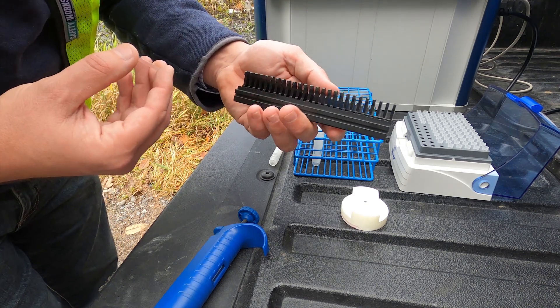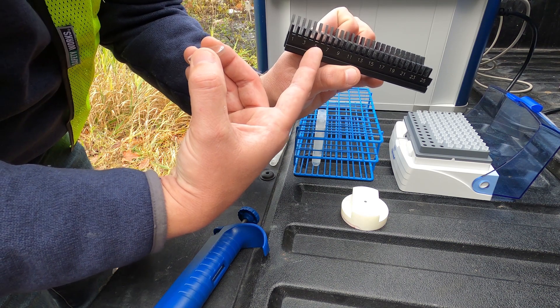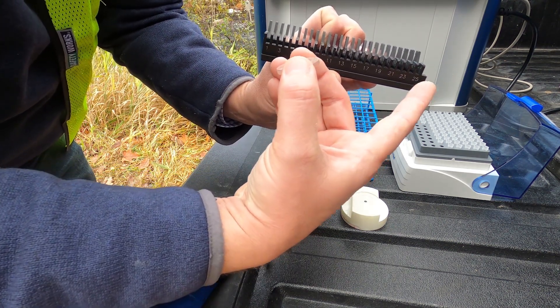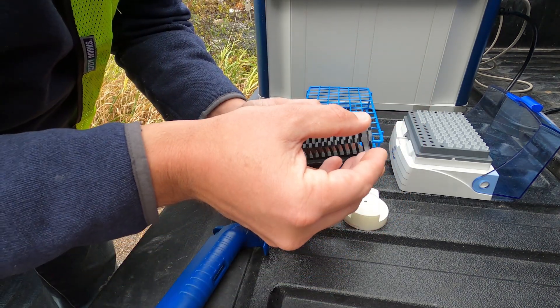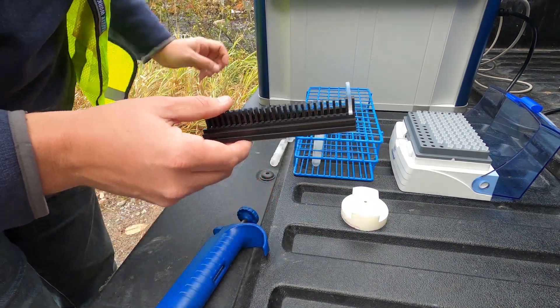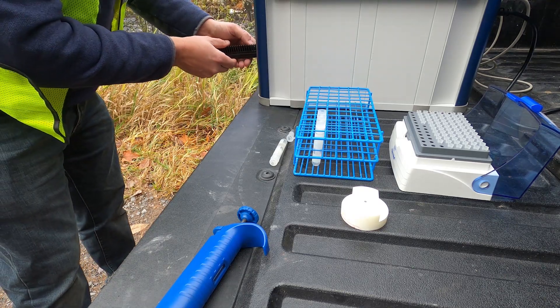We will then take our sample changer. This is a 25-disc sample changer going from 1 to 25, so we can automate the system to continuously run all of these samples. Here we're going to place the disc in sample position number one, load the instrument, and start our data acquisition.